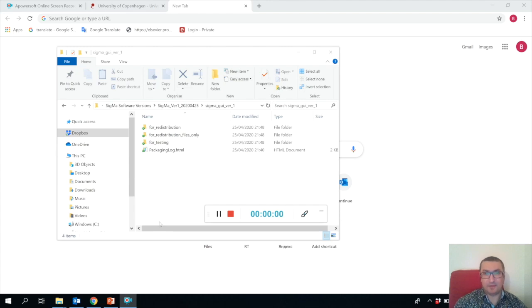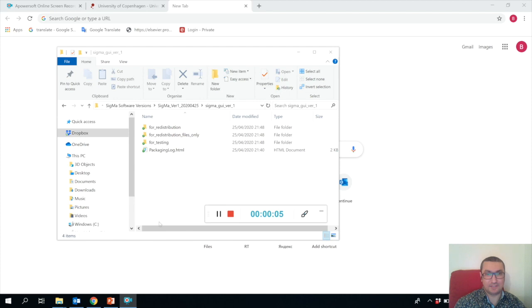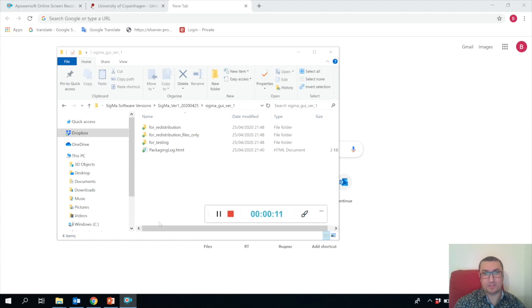Hello, my name is Specsot Hikimap and I would like to show you how to install software called Sigma, which you can use for processing raw proton NMR metabolomics datasets.